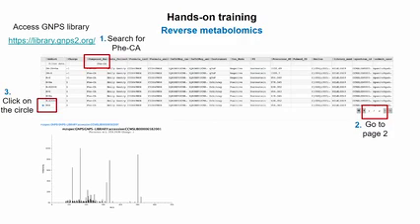Yeah, I've been playing with MASST, and it throws out a lot of data that claims to be bile acids, because I've got a bile acid conjugate library, and a lot of it, as I've got a post from this list here at the meeting, most of it's rubbish. Yeah, I didn't know that, but good to know.